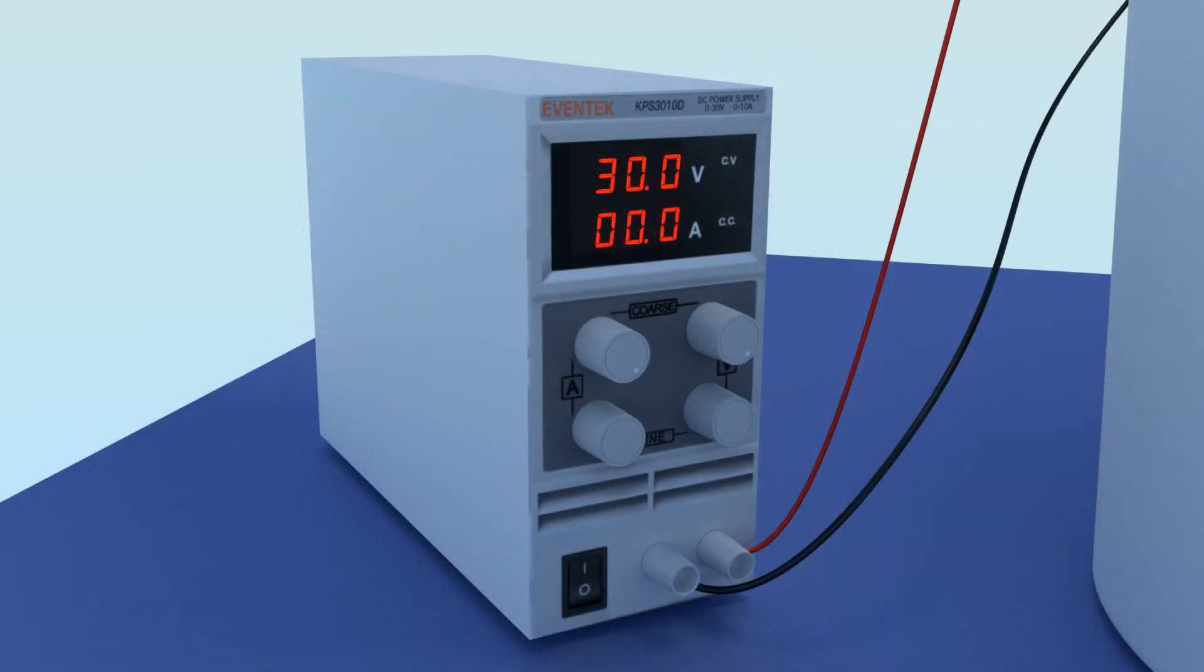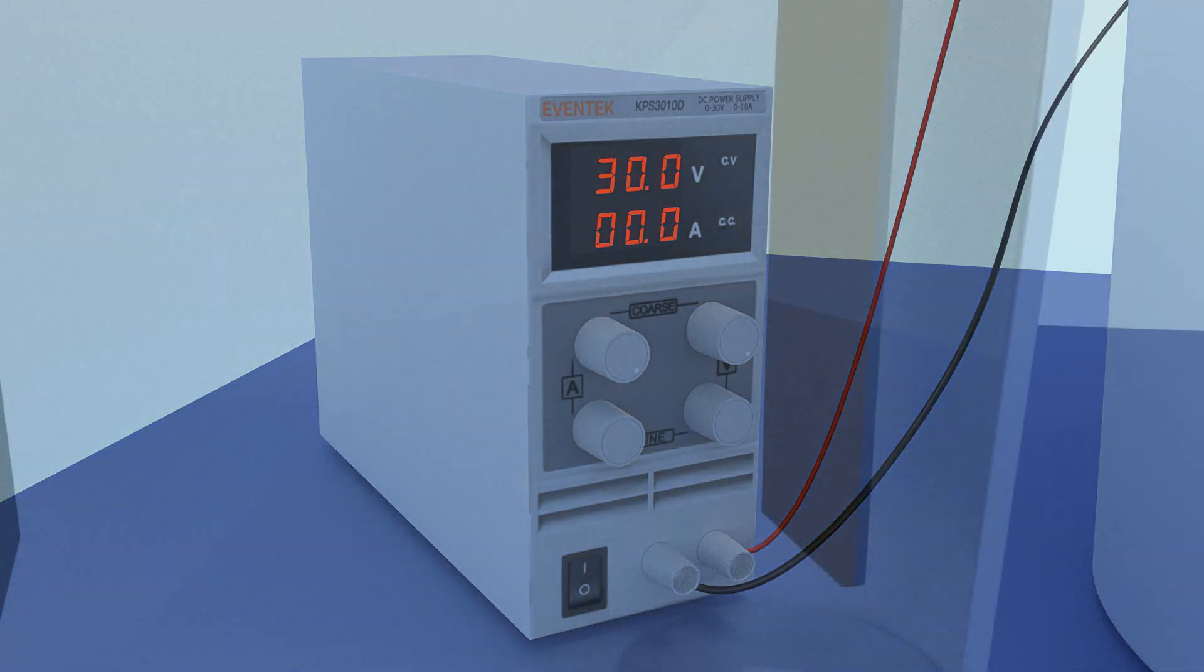When the amp gauge reads zero, the solution should become colorless. All the metal has plated out of solution. You can then recover the metal and discard the solution.